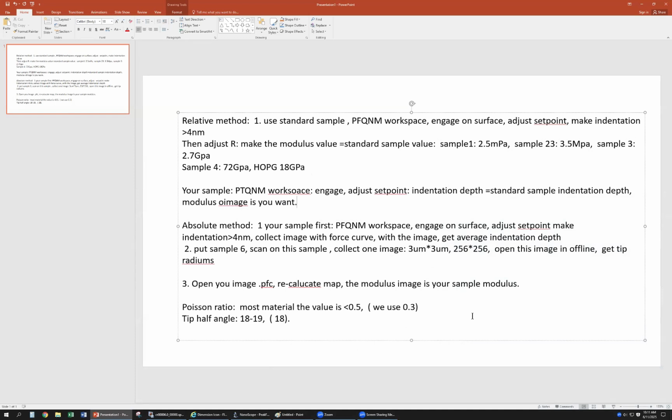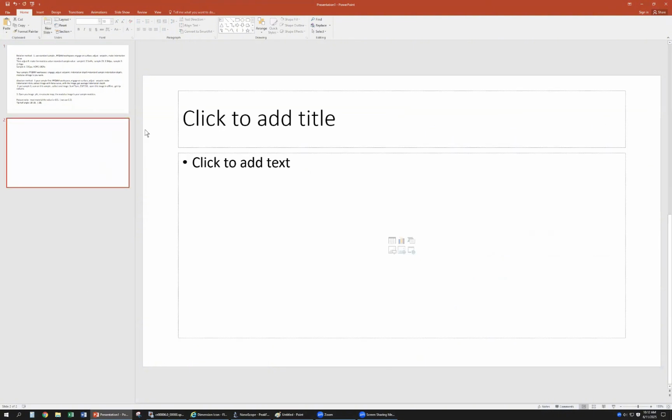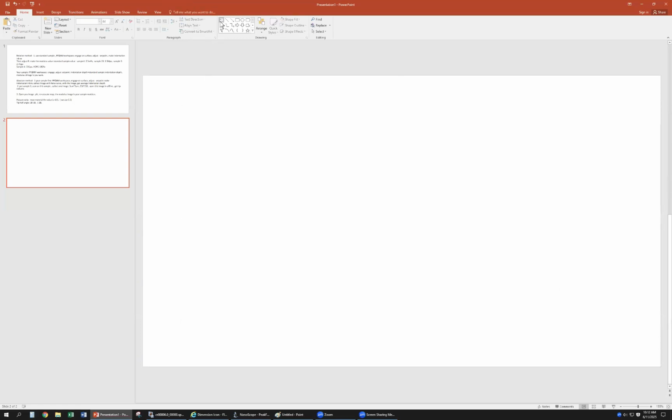So that's all the problems. Any question? If no question, we can do that one by one. Okay, yeah. Let's do one more. New slide.